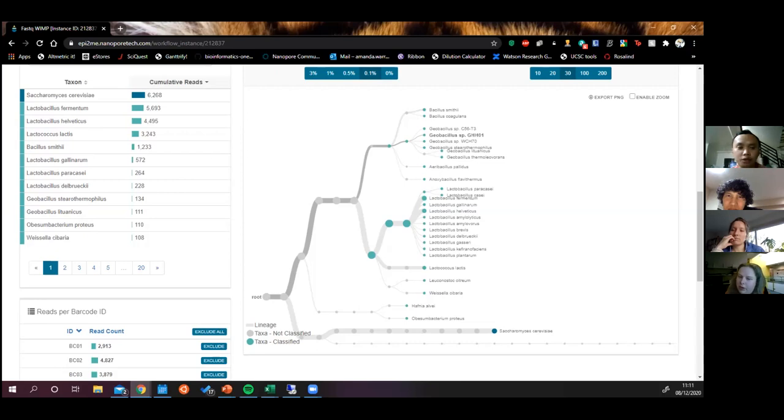If not, is it also possible to combine whole genome sequences for those that we have the whole genome, and just barcode sequences for species that we only have barcodes for now? On one flow cell? I mean, in the database for the taxonomic profiling. I haven't tried it. You could try it. I'm not sure if it would just end up confusing, to be honest. Particularly your abundance profiles would be confusing. I think I would preferably keep it separate. Again, if you did the sequencing once without doing the analysis in real time, and then tried the analysis on both different ones and then decided which one works best, I think that would probably be better than trying to do everything at once.